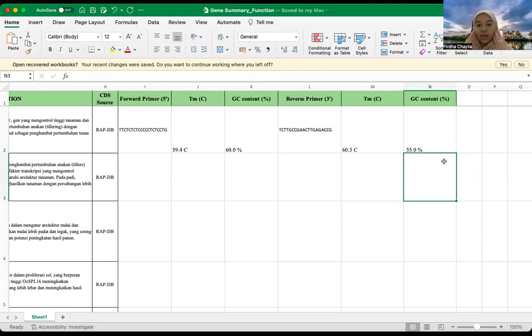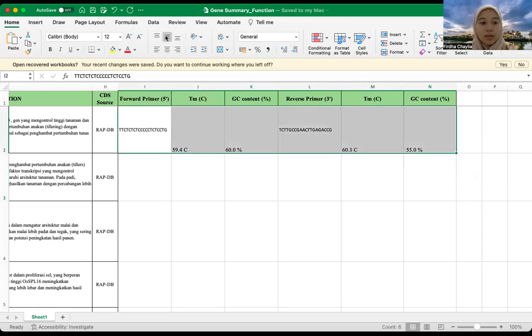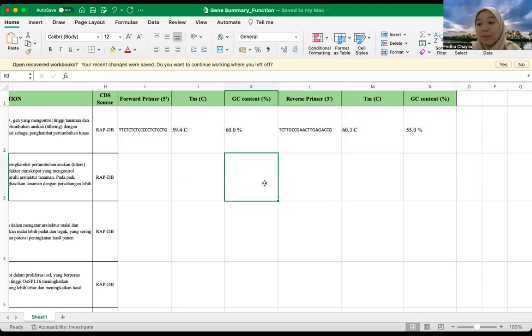Completely well done. So you can see here about the primer design. And what's next after this? You can order the forward and reverse primers from a genetic company, and then you will get the pellet, and you must aliquot the pellet, and you must have a wet laboratory, I mean, and then you must do PCR amplification to make sure that your primer really works well.